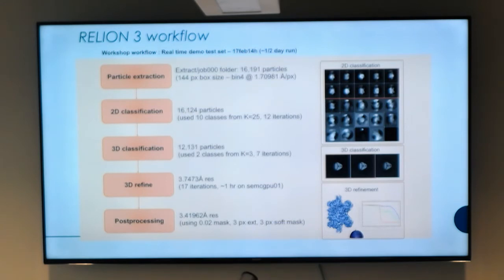This is quite reasonable in the sense that, okay, we might not be working with an entire data set, and we might also do very severe particle sorting. But this would give you a good indication whether or not you want to work with this data set some more. So you can say, okay, with doing this crude workflow, I have 3.4 angstroms, and then there are other things you can do. You can reprocess it, let's say you can unbin it. Well, unbin I already showed you gets down to 3.1, and there are other features you can run. But the advantage is that if you do some preliminary analysis, it only takes you a few hours on the data set, then you have some quality estimation on this data set.